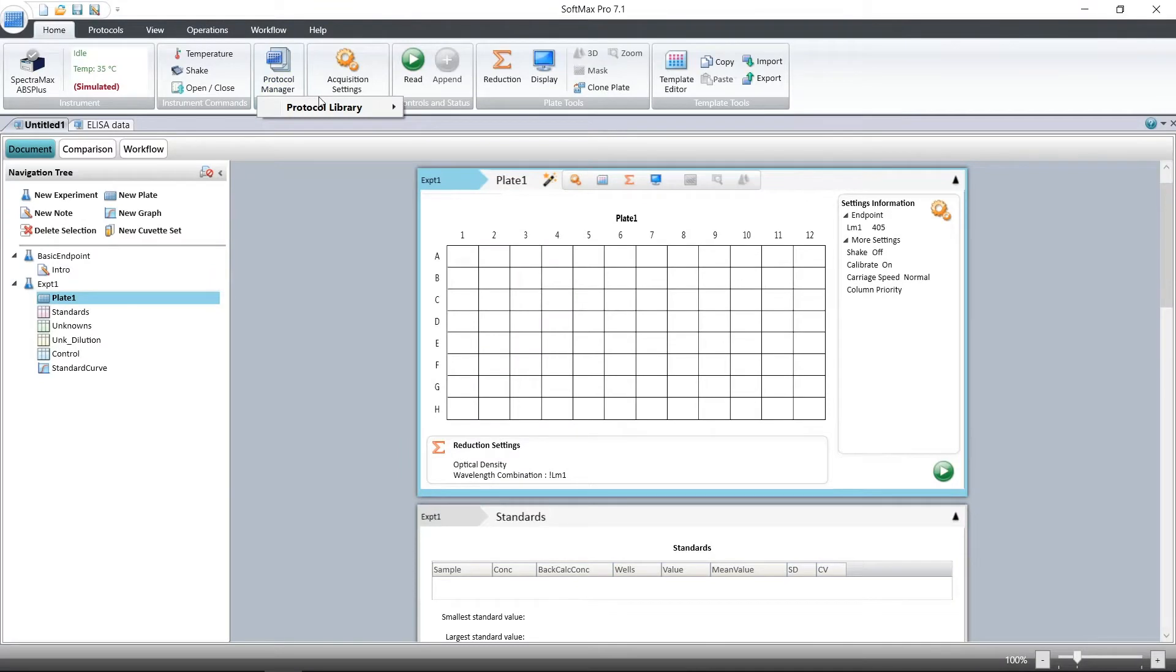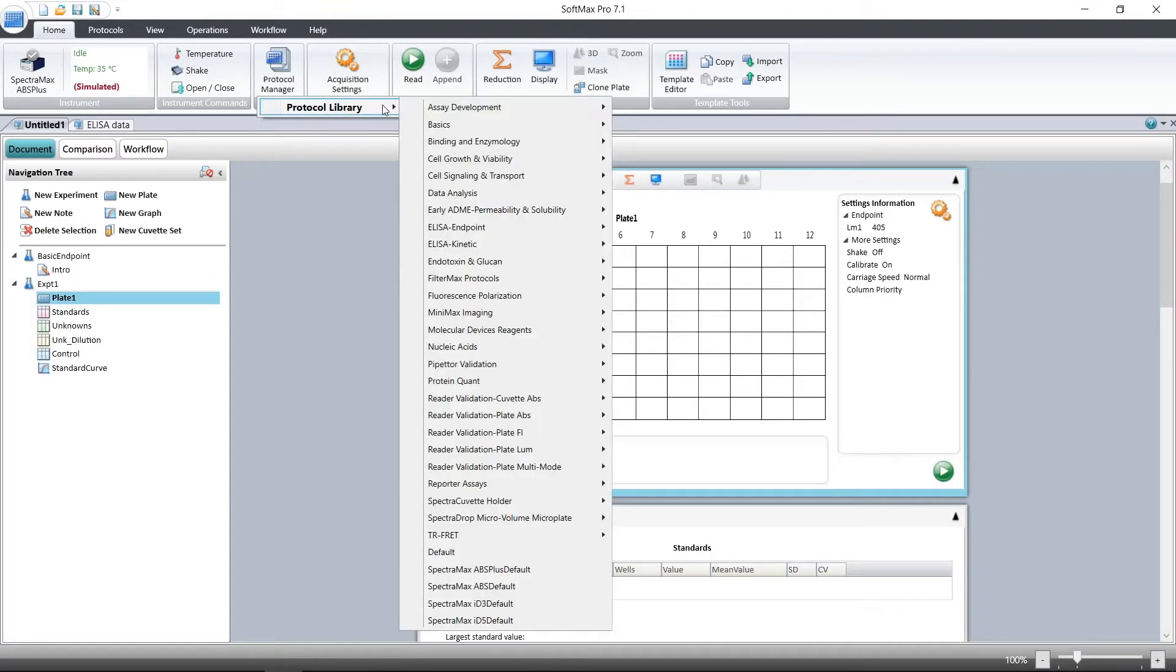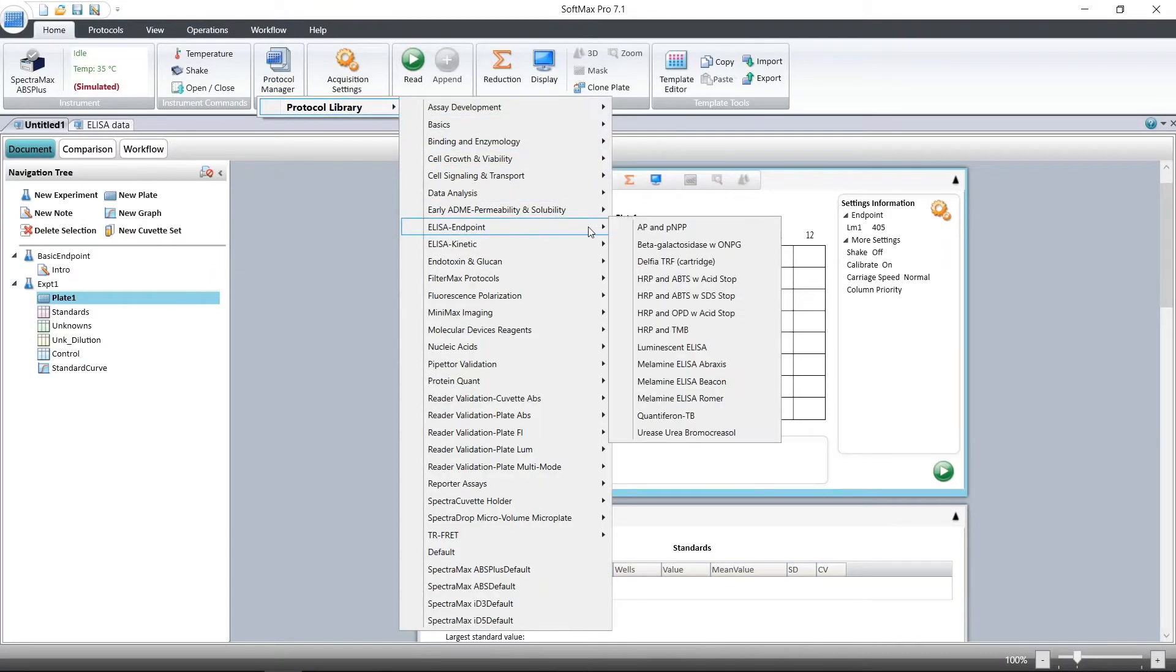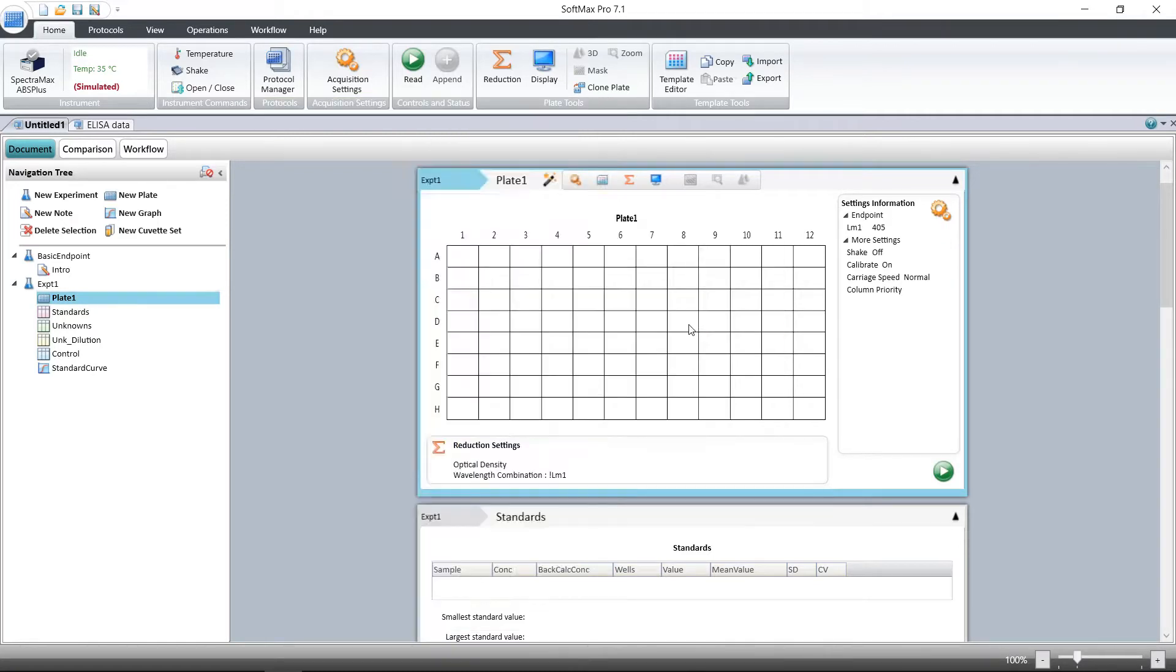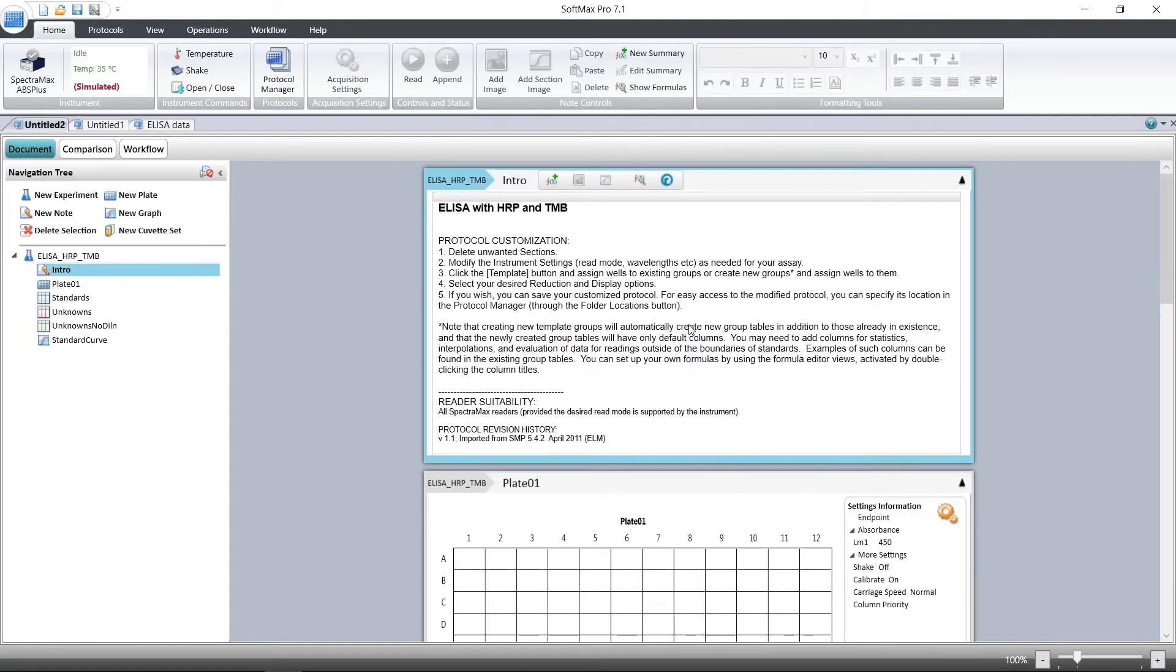First, open the protocol in the protocol library. Here we're using an ELISA endpoint protocol with HRP and TMB substrate. The intro shows how to use the protocol.